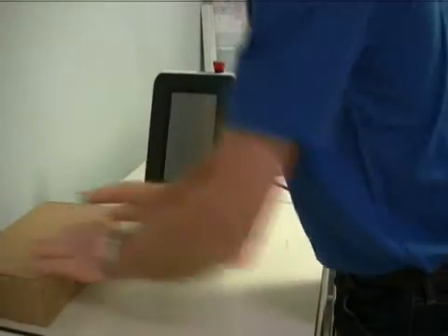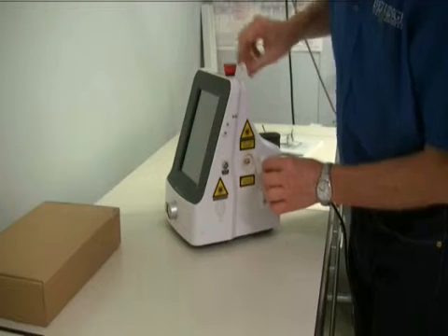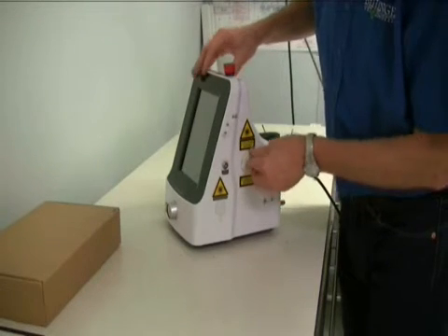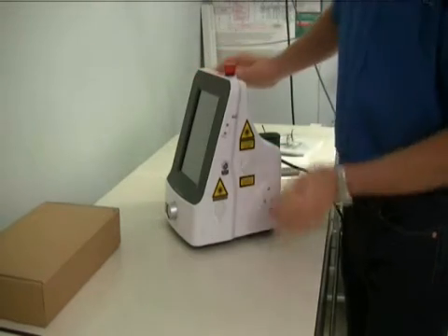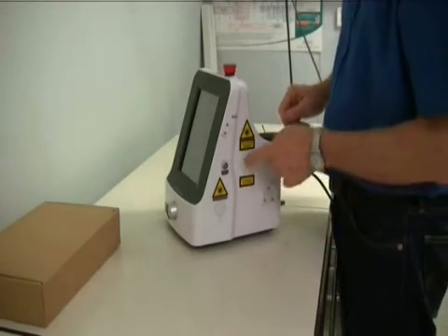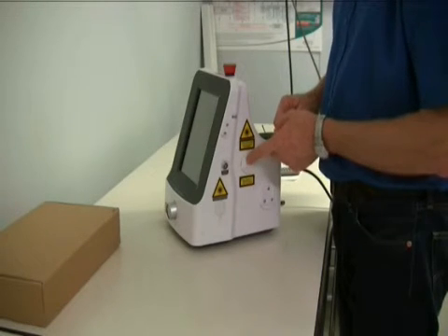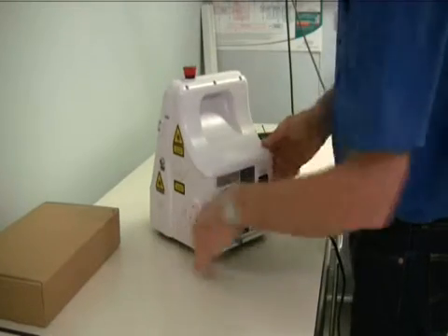That's all packed away safe and secure. Remember, on the back of this unit, this port here needs to be covered. There's a rubbery plastic cover you can push over like that. There's also a metal plug that you can screw on if you're going to be leaving it covered for a long time. Otherwise, just leave it like this if it's only a brief time.